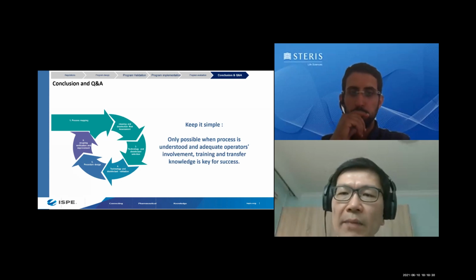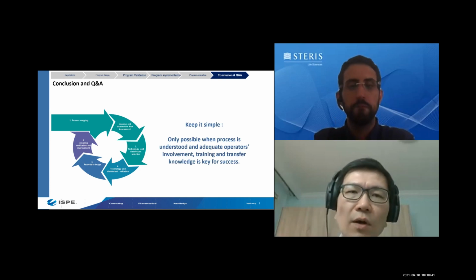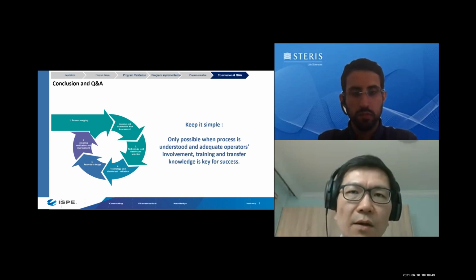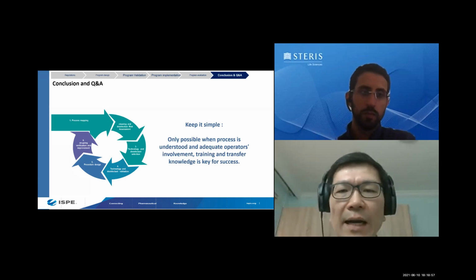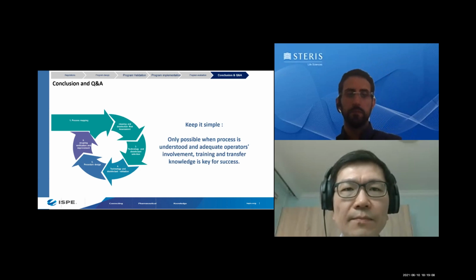Of course, there are also other methods which can involve a specific room, for example. You can look at the data at T0, T1, T2, compile the total CFU for the specific room, and also calculate the CFU per plate at each time point for that room. So these are some of the methods you can consider. There is no fixed guidance on which one you must use, as long as you can use it to demonstrate that there's a downward trend after each cleaning, then that should be fine.